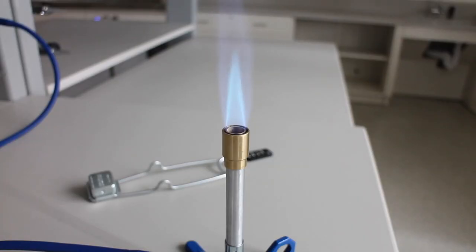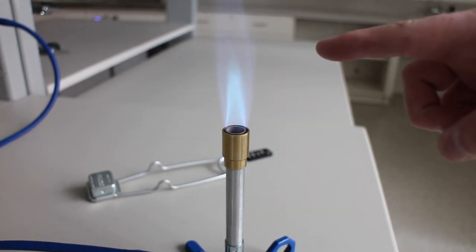For many applications, you'll want a double blue cone. Notice the outer blue cone and then the inner blue cone. It's the tip of the inner blue cone that is the hottest part of the flame.